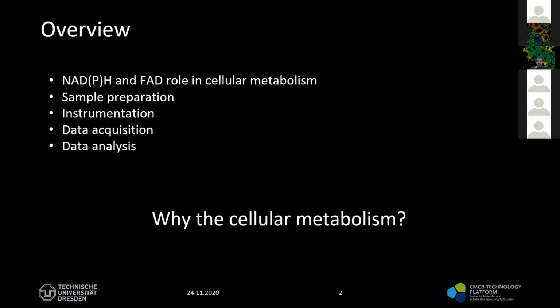However, we need to know why it is important for us to assess cellular metabolism. Many people know the answer, especially people with a background in biology, so I will just review a few small cases. In the talks of Angelika Hook and Amazi Priyasamy specifically, they talked about the potential and the abilities of this technique, metabolic FLIM, to address clinical diagnosis or biomedical studies.